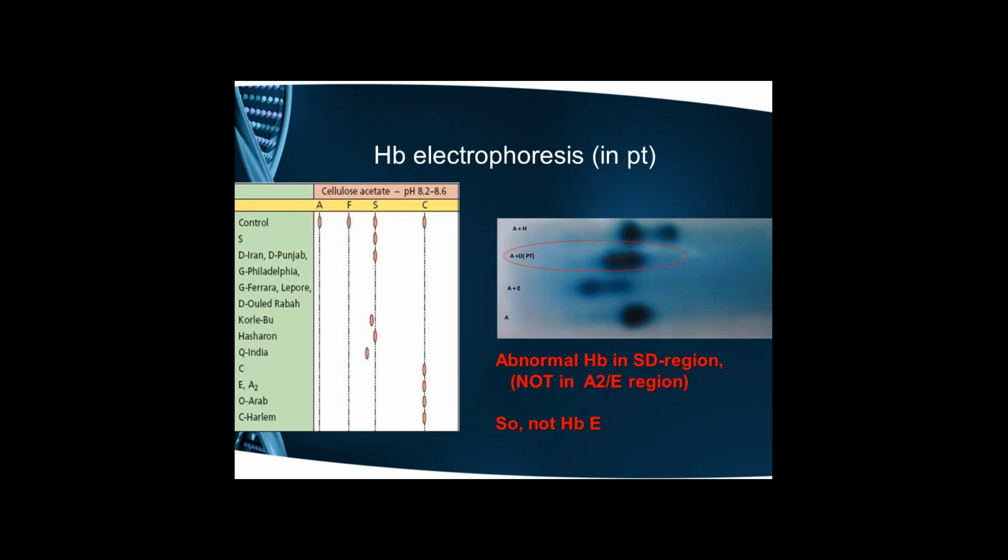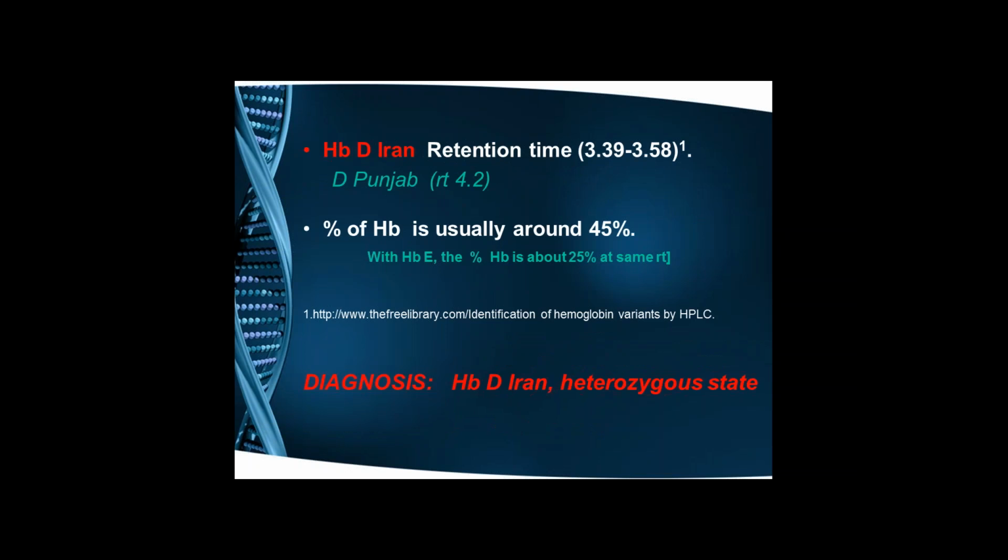Next. There are various references for it. Next slide. Whenever needed, we should resort to a second technique also.